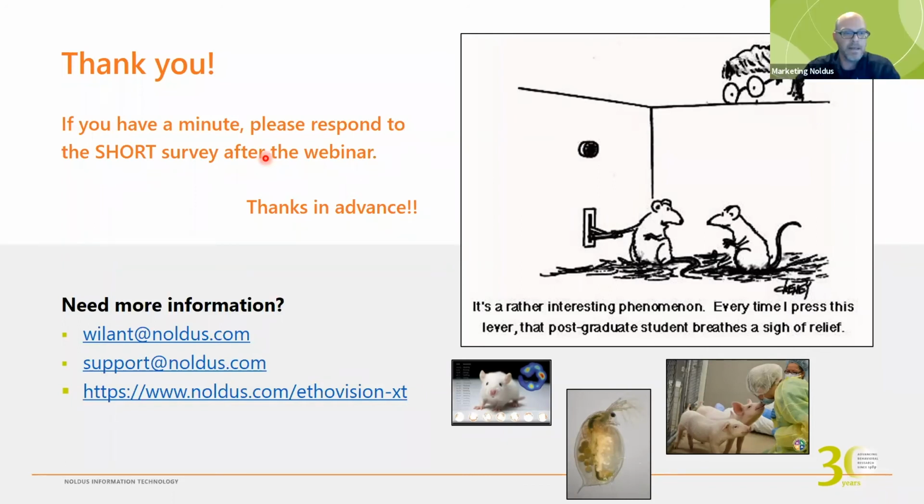All right, so here I have a specific question regarding detection settings. I have several different sized animals and my detection settings need to change over trials. Each time I make detection settings, it overrides the previous one. Is there a way to have several different detection settings concurrently in one experiment?